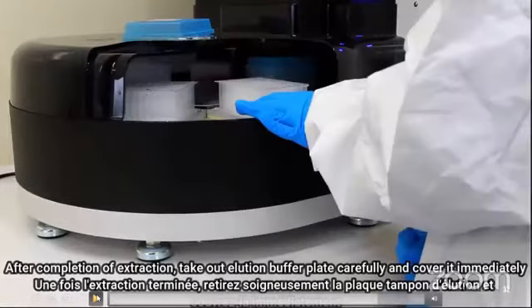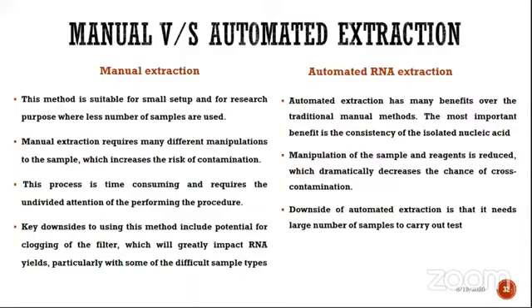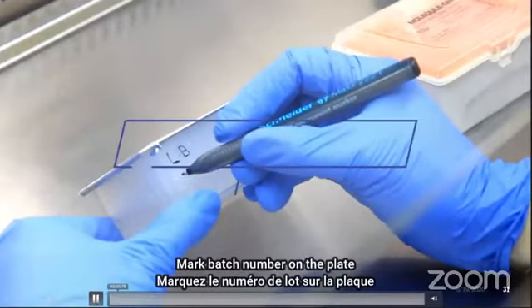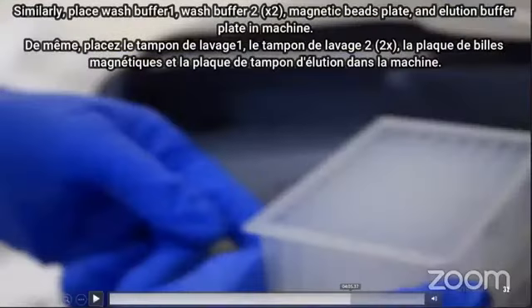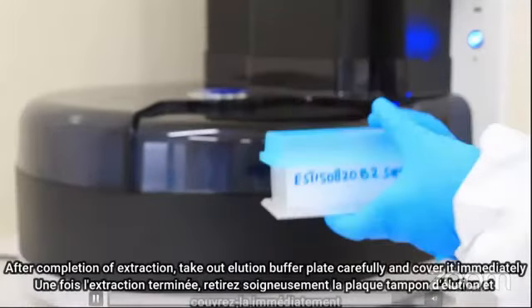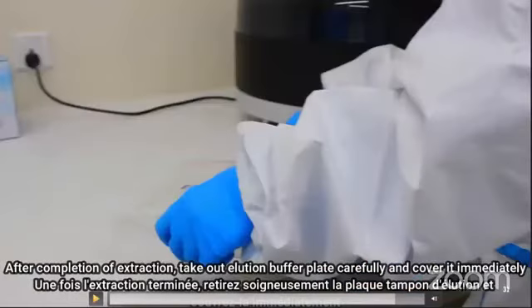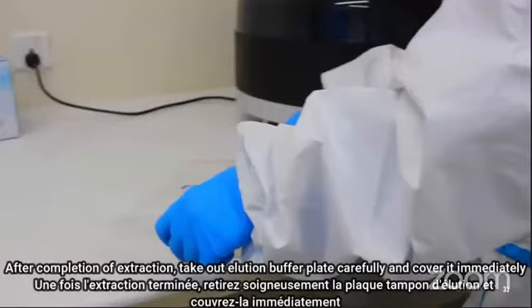It takes around 40 minutes to extract out the RNA, and after completion of the RNA extraction, take out the elution buffer. Check the plate carefully, check the label carefully, check all the deep wells carefully, because sometimes some wells become empty and we need to repeat the samples.